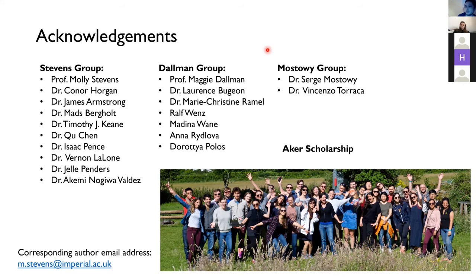There is a paper from 2014, I think, with Bennett as the first author, where they solved this by imaging fluorescence in the green region, and then moving the Raman laser further towards the red part of the spectrum. So there's no overlap, and I think it would be very, very interesting to see if someone could combine our imaging capabilities here with a fluorescent setup, because I think that could be quite powerful.